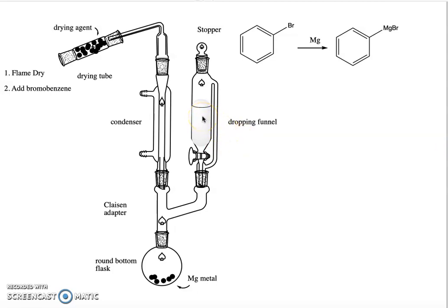We add the dry ether in the same way using the graduated cylinder and adding it as carefully and as quickly as possible. So this is a mixture of bromobenzene and ether that gets added to the magnesium metal.